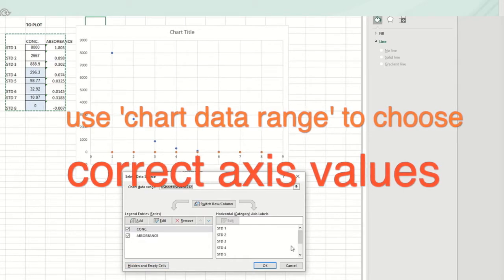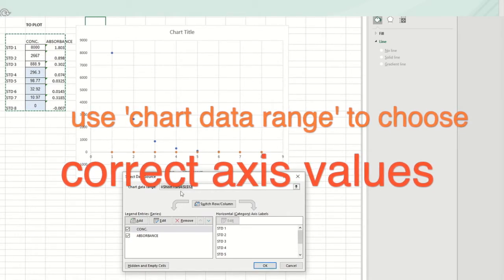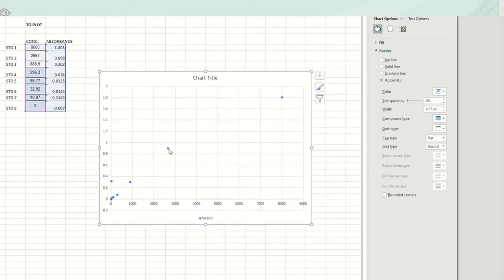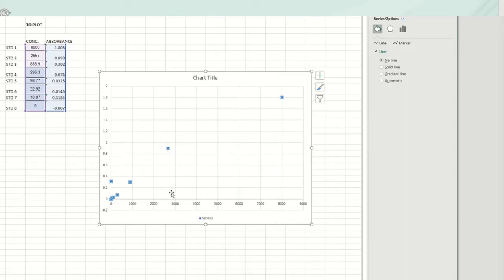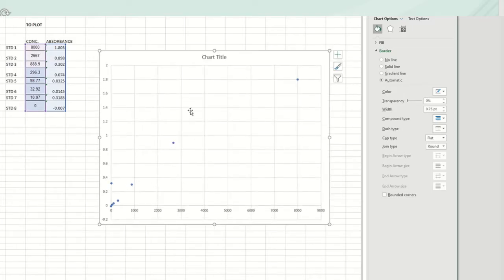So I'm going to fix that up. I was able to select the chart range, and as you can see now, it's got the points here. If I double click it, you'll be able to see that these are what it's using in the blue as the absorbance values, and it's gone ahead and treated this as an axis value, which I love. And because there's only one series, I can get rid of the legend because we don't need that. We're not comparing multiples. So I go ahead and change the title, and I can say hormone concentration in serum, and it was in rat serum.